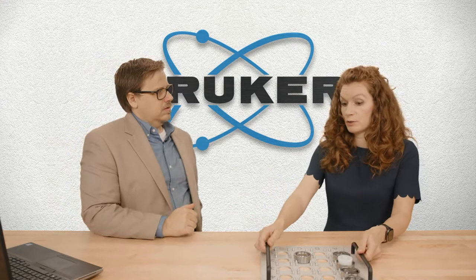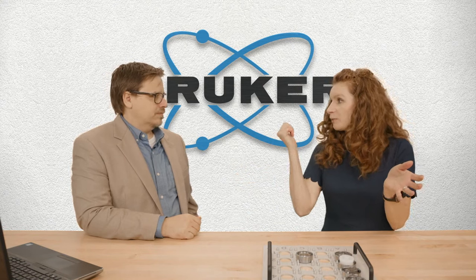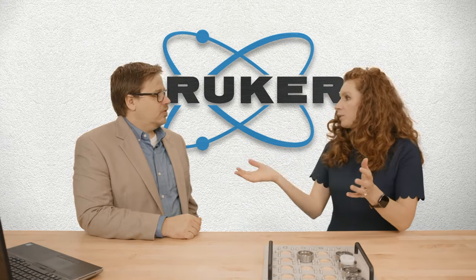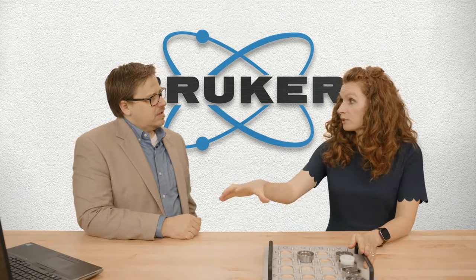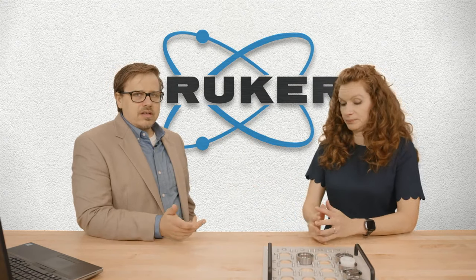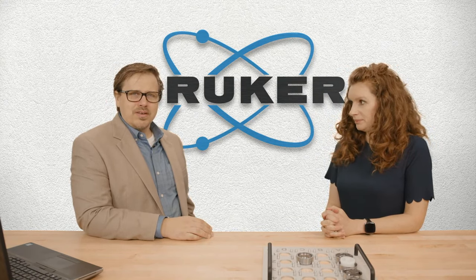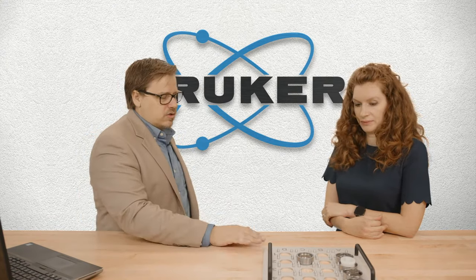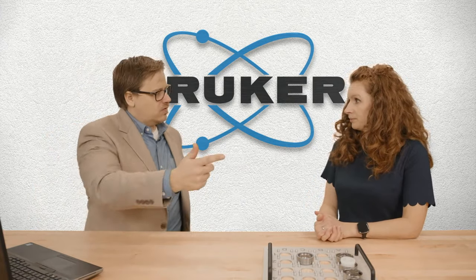I said it's a backup, right? So maybe you have a PM going on, but you still need to run samples, right? You can take this tray and put it into your S6, or you can put it into your S2. You also can put these into a D8, so it's compatible between techniques as well. So the Endeavor, I can't remember if we've talked about that before on Live from the Lab, but there is a video about the D8 Endeavor, and sure enough, there are those trays. So you could just walk the tray from one machine to the other. Correct. Or you could have that conveyor belt connect.